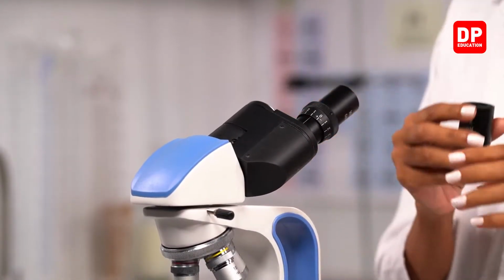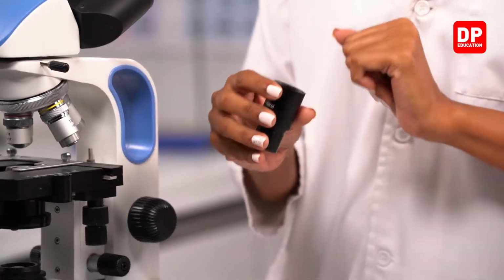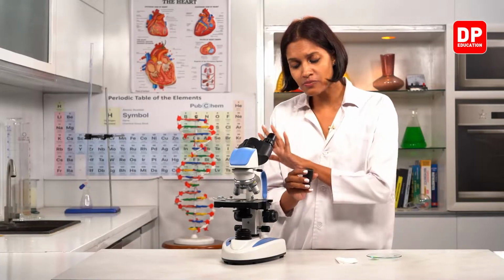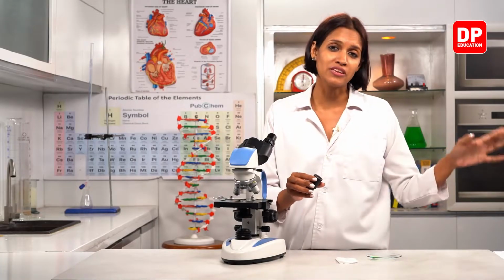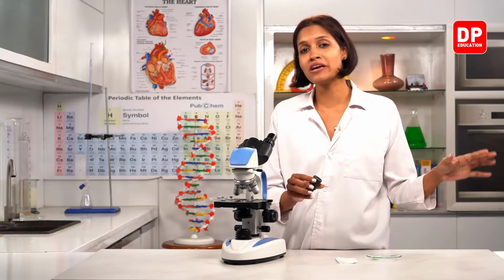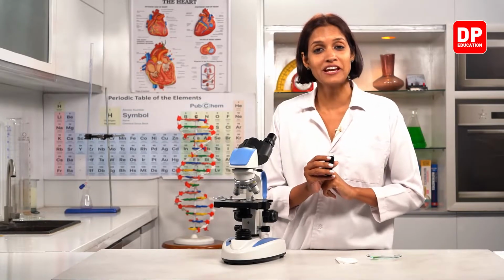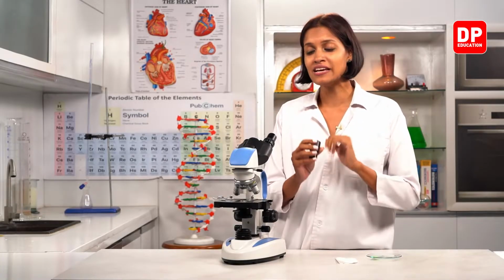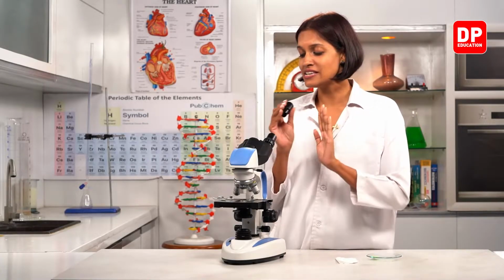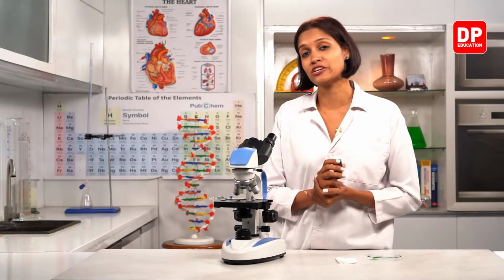Most of the time, these lenses get damaged by fungus forming on them. So if this lens has fungus, when we change it to another microscope, the other microscope will also get fungus. Right, children? Fungi are microorganisms, they spread everywhere, right? That is why we should never change the lenses of one microscope to another.